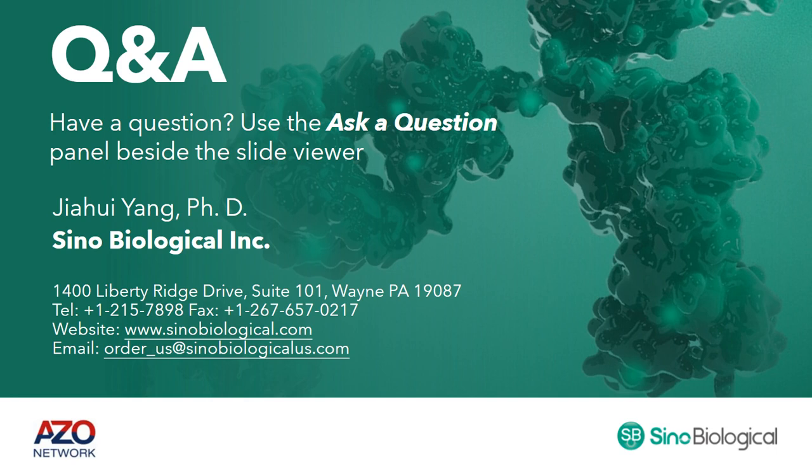Usually, we are able to obtain positive clones after three rounds of screening, but if few positive clones are obtained after three rounds, we will try another one to two more rounds to get more clones.